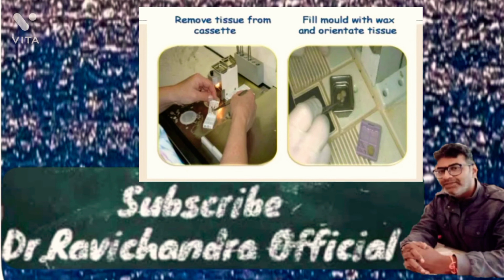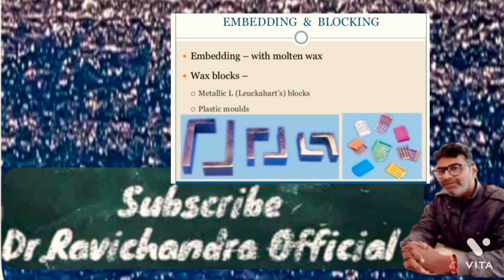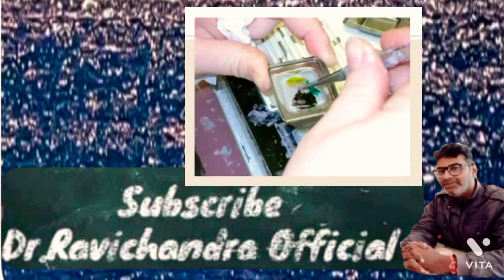This is achieved by placing tissue in metallic angle or L molds, Leuckart's molds, and cooling in case of paraffin, and heating in case of epoxy resin for electron microscopy and acrylic resins for immunohistochemistry. In case of an automated tissue processor, tissues are still in the cassettes, so pick the tissue out of the cassettes and pour molten paraffin over them using an L mold.